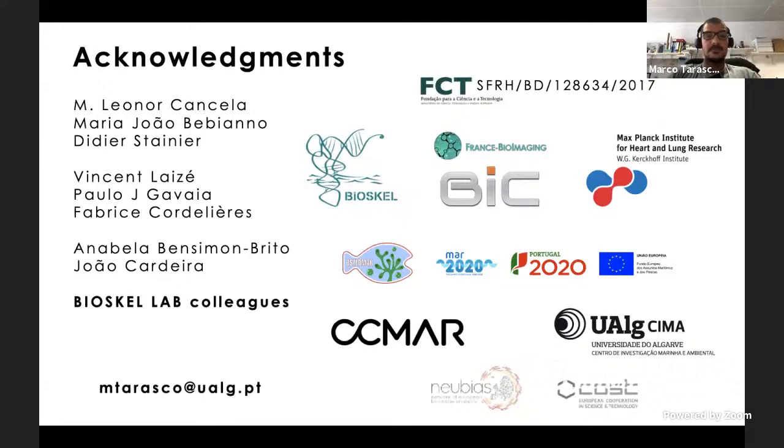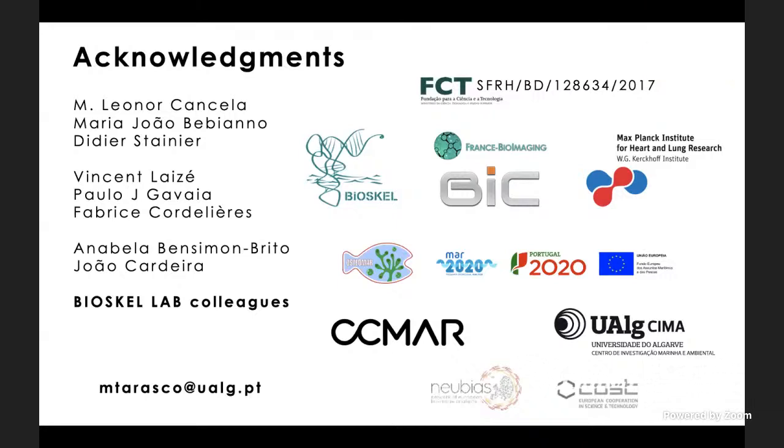But for example, on the Fiji website, there are already some guides to give you a starting point and also for writing your macros. Fiji also has the possibility to record what you do during your analysis. That of course needs to be adapted, but still can be a start for creating small macros. After using the record function, you can also edit those macros, no?